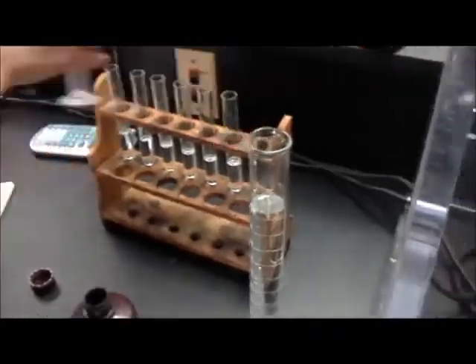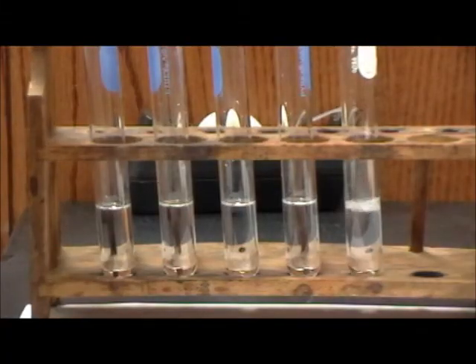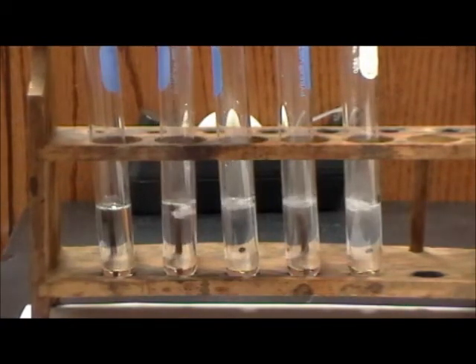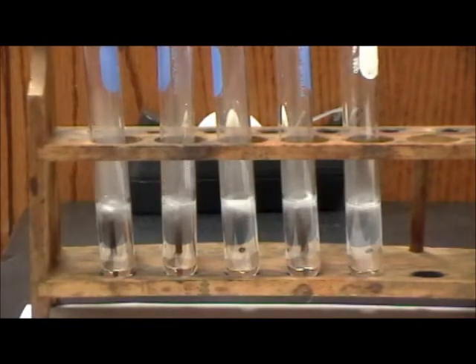Now put the weakest acid to the left and then go from the 1 upwards to the stronger acids on the right hand side, and again add your strips of metal as quickly as possible, one at a time, while the other person in your team has started the stop clock and records the time on the stop clock when each reaction finishes.